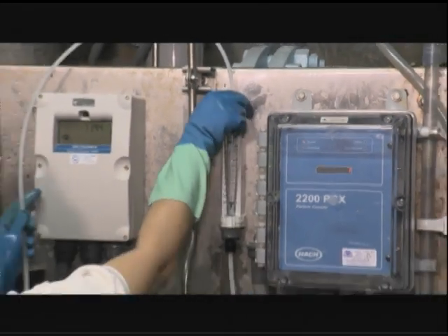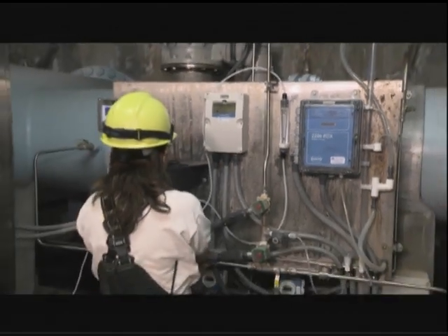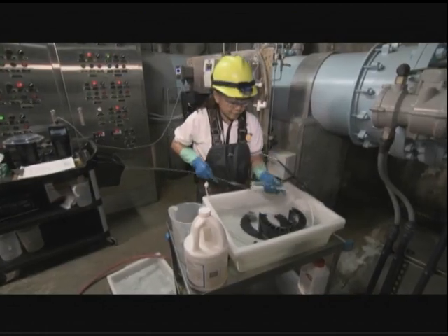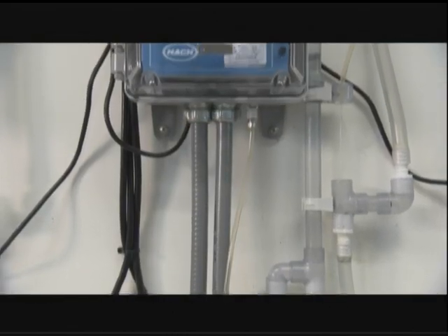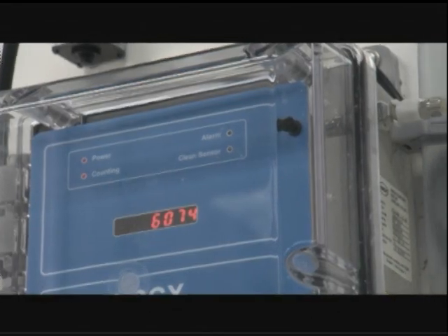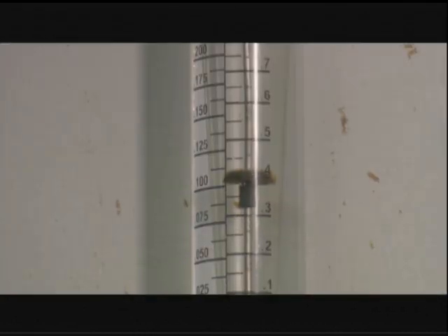The most popular types of particle counters used by water utilities are batch and online. With batch particle counters, sample water is collected in a container, and the particle counter's sampler draws water from the sample to create flow through the sensor. Online particle counters draw water continuously from the sample location through tubing that's connected directly to the sensor. A flow controller is required to regulate the flow of the sample.